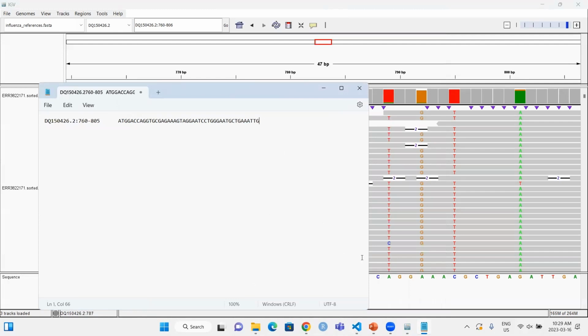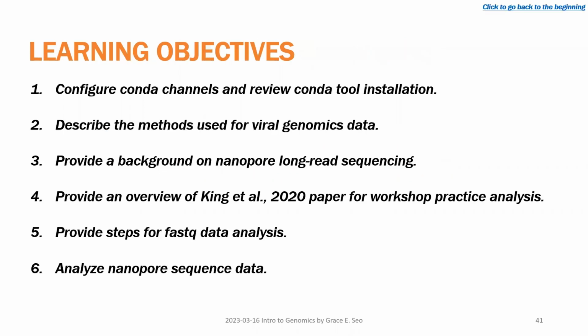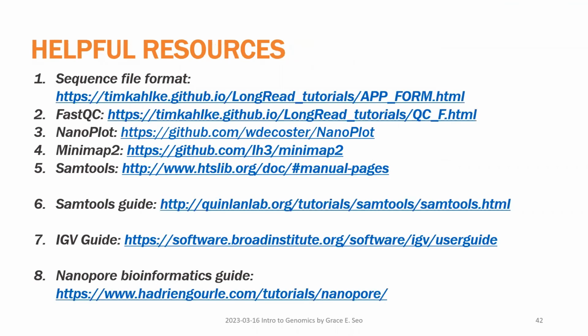So that's really what I wanted to show you today, just a very simple analysis method for sequence data you may have. There's a better way, there's a different way, depending on what questions you're answering. But this is just one simple way I wanted to show you. So we've reached the end of our workshop. You've got all the analysis, so just practice on your own, so you get familiar with running the tools on conda and the bash terminal. And be ready for next week's bacteria data analysis if you are into bacteriology.